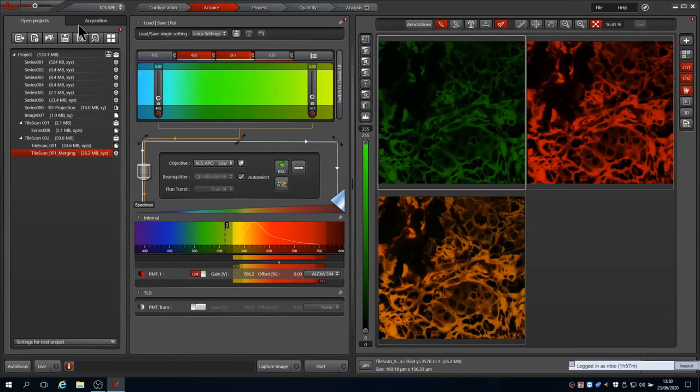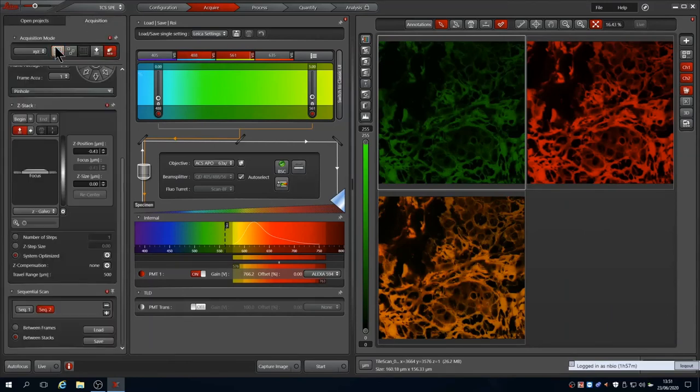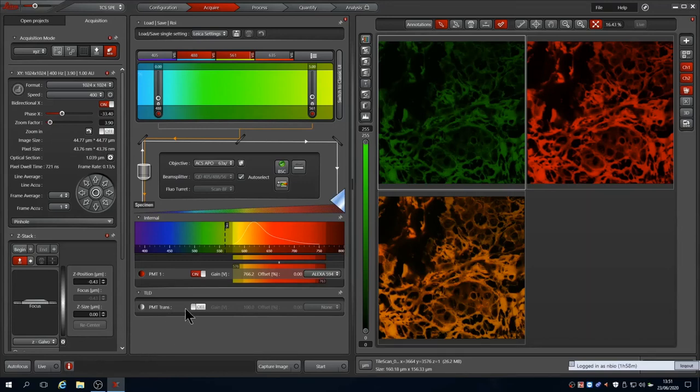Now let's go back to Acquisition. You can switch off the Tile Scan by deselecting the Tile Scan icon and look at Transmission Imaging. The Transmitted Light Detector, or TLD, can be switched on in any of your channels. It performs better with the bluer lasers, so here we select Sequence 1 which uses a 488 and switch on the TLD.